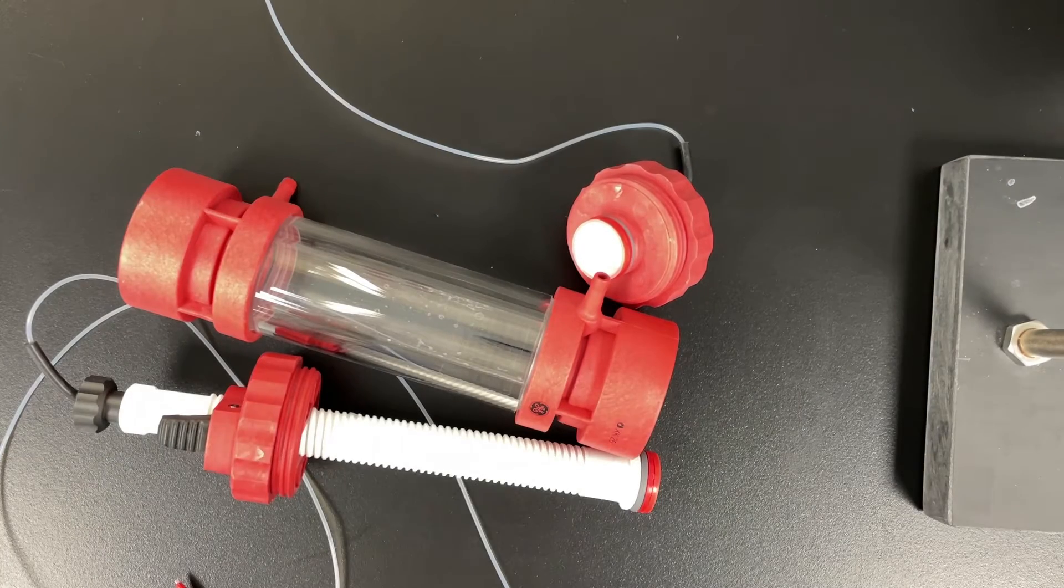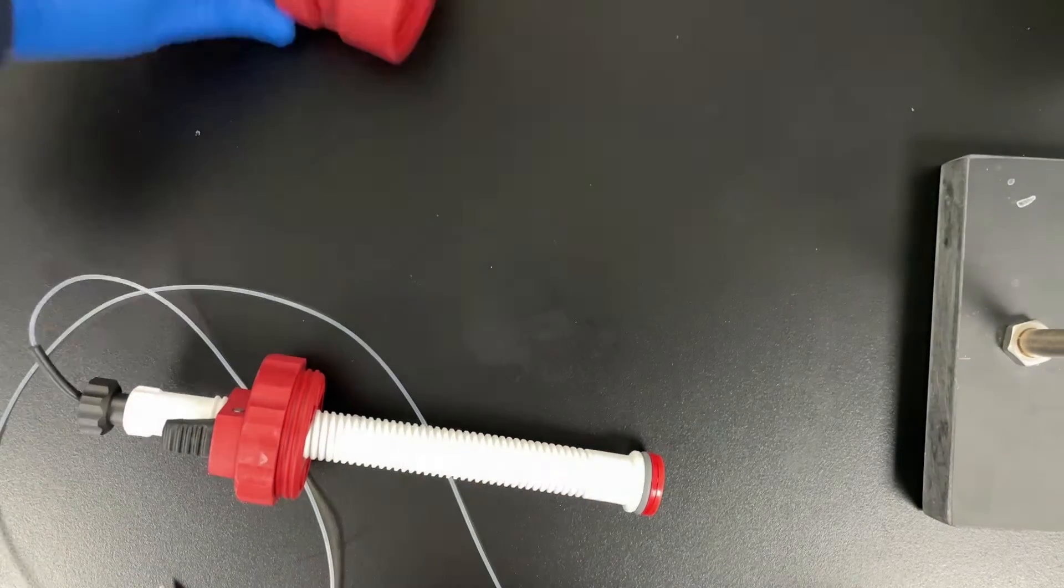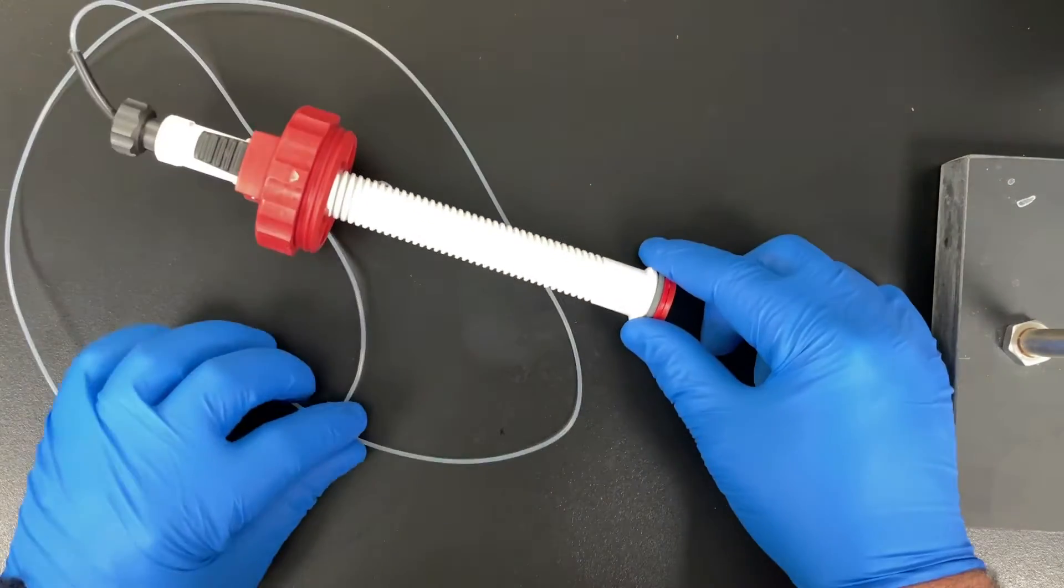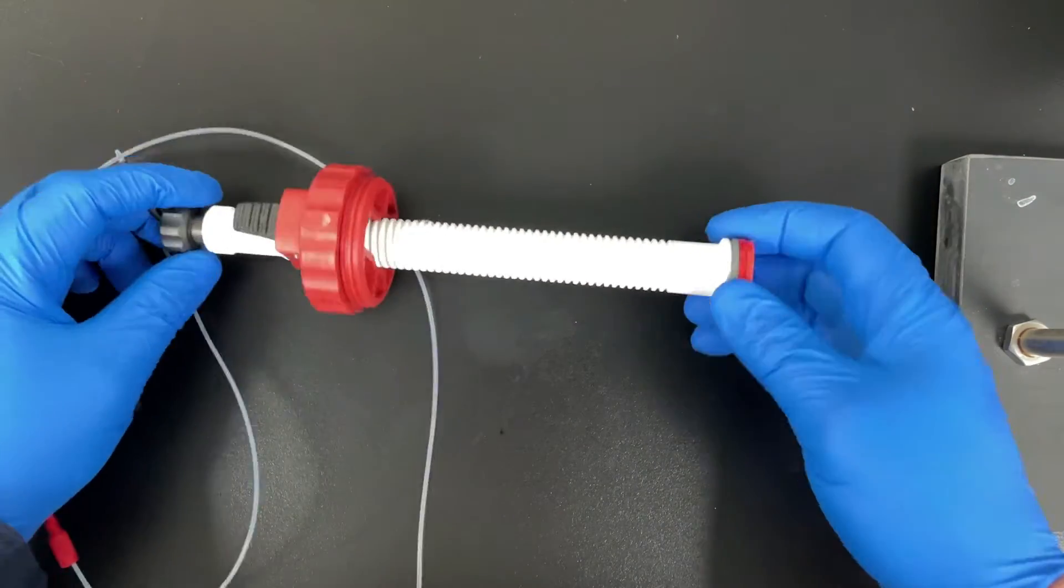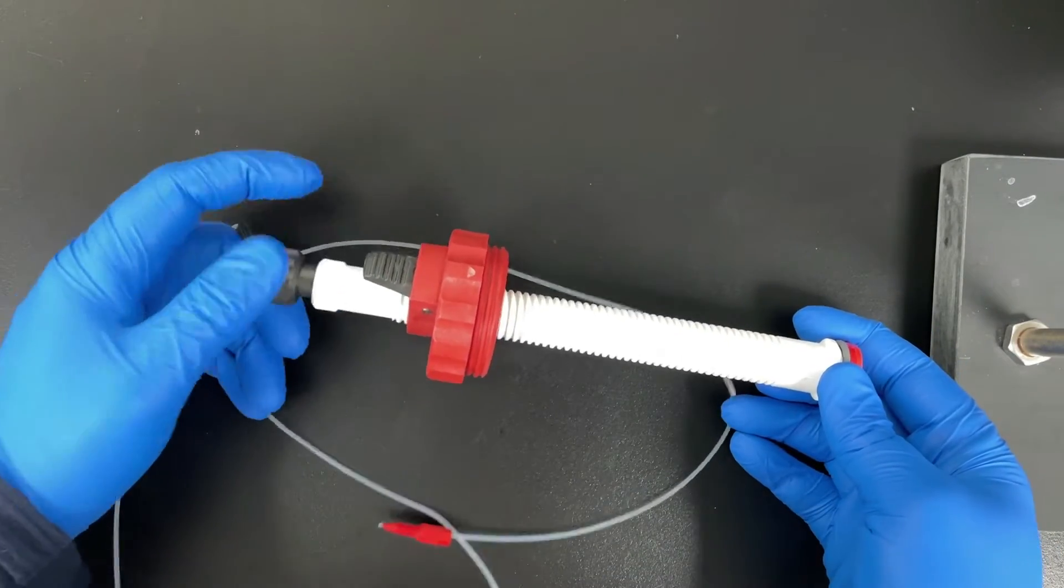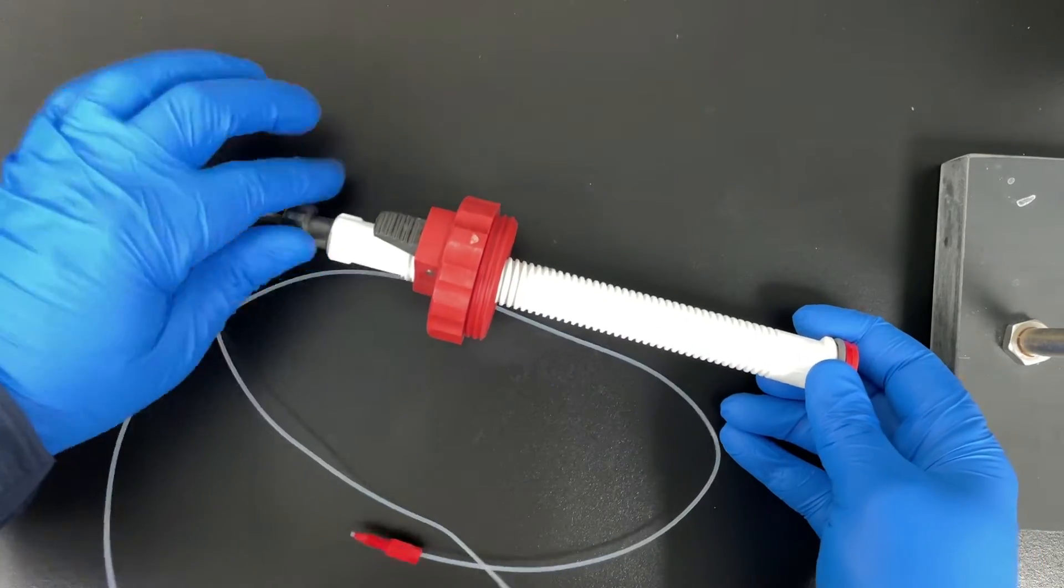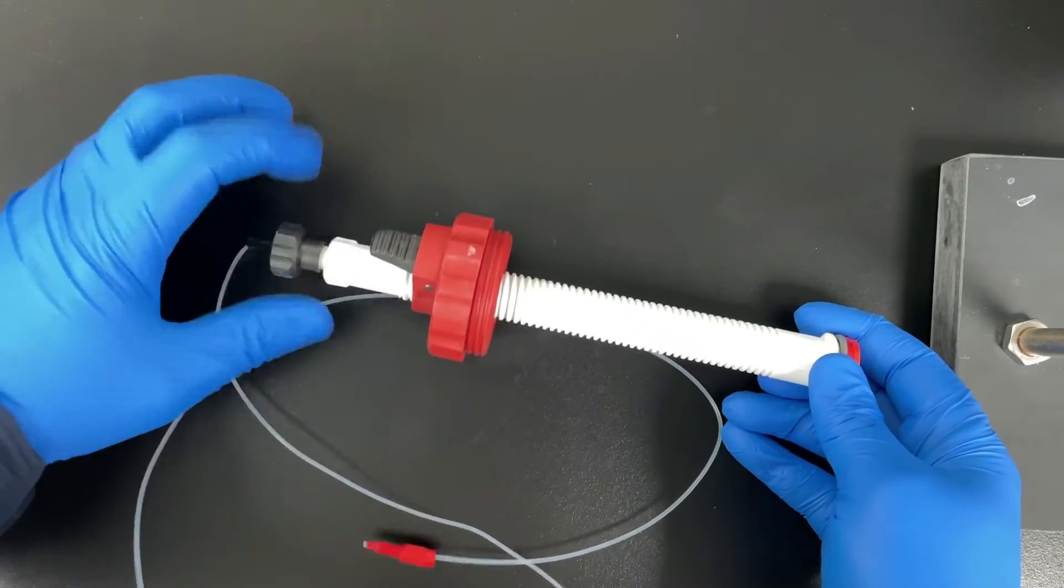I'm going to use this XK26 column for the pack. The first thing we're going to do is check the top adapter to make sure there's no obvious damage to it. Then we're going to start unscrewing this black knob on the top. We're going to take it all the way off.